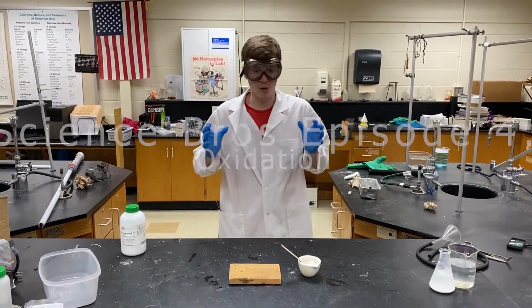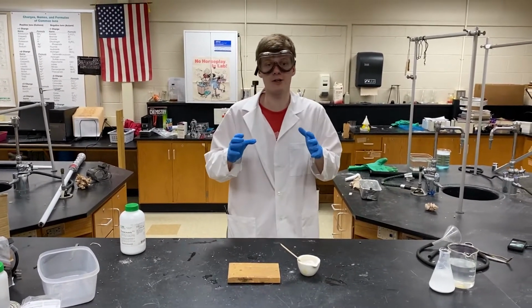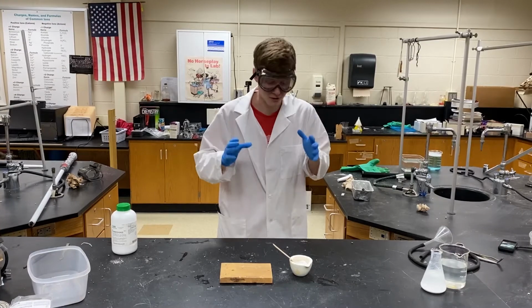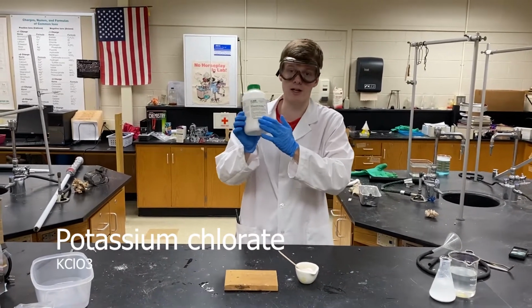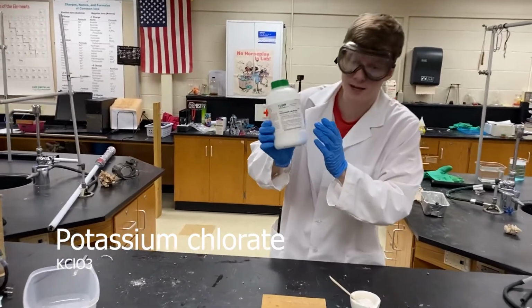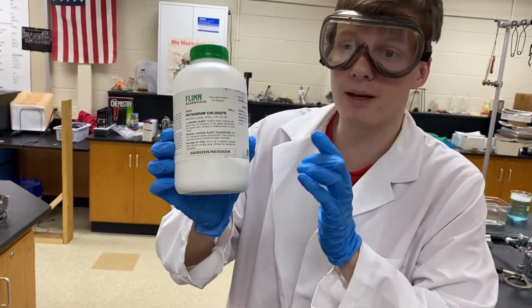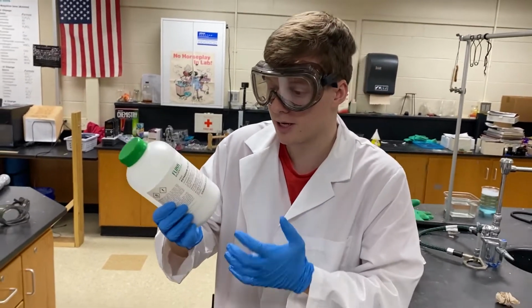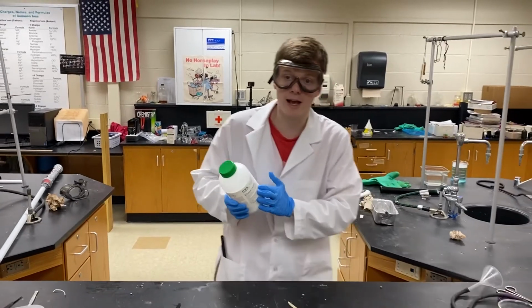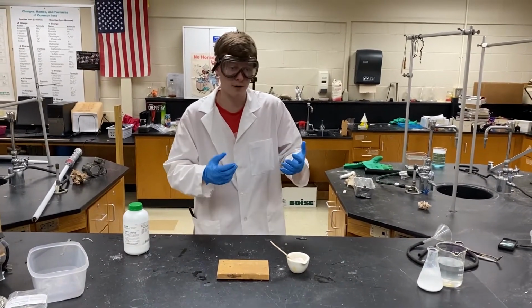We're going to keep the trend going with some chemical reactions today, and we are going to do a little bit of an oxidation reaction and a combustion reaction. So here I have potassium chlorate, KClO3, that's its chemical formula. Potassium chlorate is a very strong oxidizer, meaning if we can mix it with certain chemicals that are going to have a lot of energy or potential energy, we basically can actually get a nice combustion reaction. We can get a nice flame produced very easily.